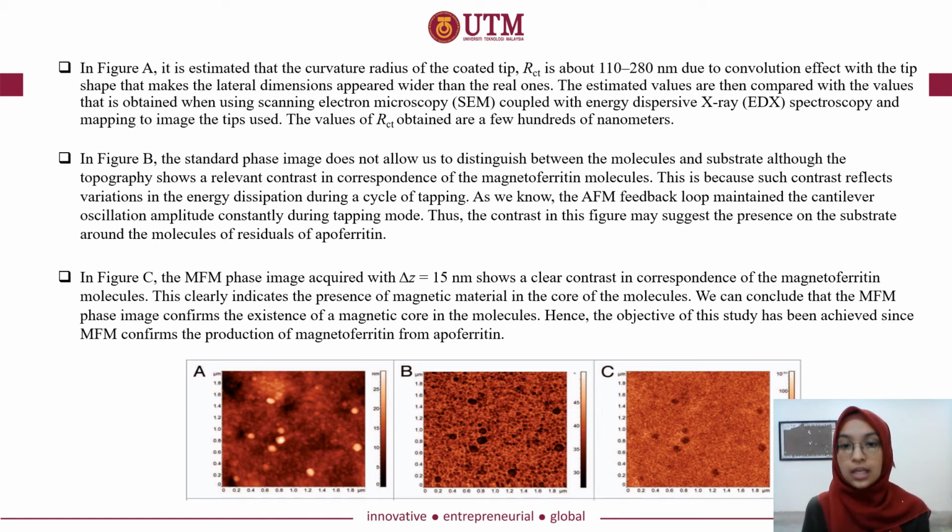As we know, the AFM feedback loop maintains the cantilever oscillation amplitude constant during the tapping mode. Thus, the contrast in this figure may suggest the presence on the substrate around the molecules of residuals of apoferritin. The next figure is Figure C.